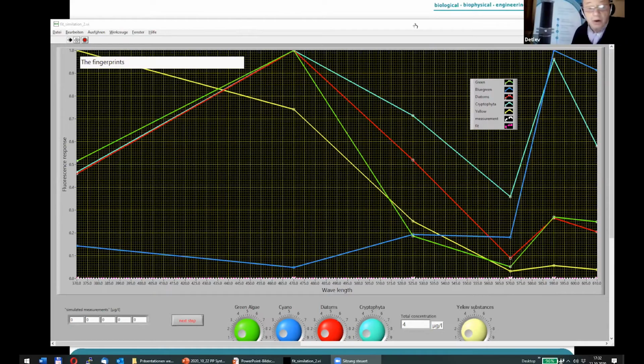And of course, what is important is that there is a linear relationship between the fluorescence intensity and the amount of algae inside. So that stands for all of our analysis.